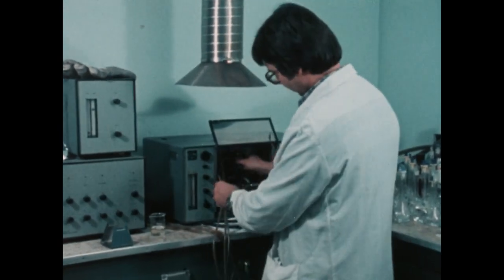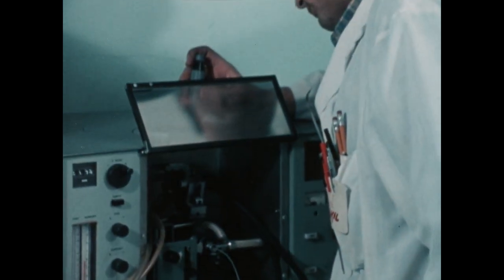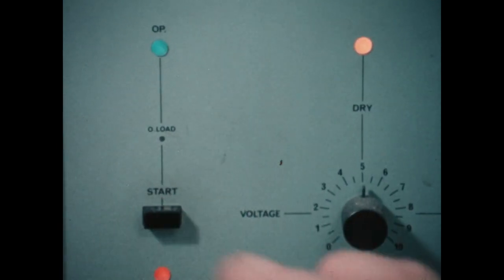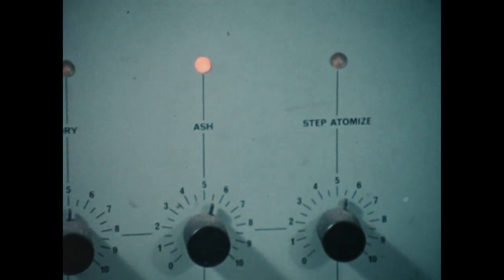When heated sufficiently, the atoms of an element give off light that can be spread by a prism into a spectrum of distinct colors. This is a section of the spectrum of gold, iron, sulfur. Spectra are as individual as fingerprints, so they can help us identify unknown atoms. We place a tiny sample of the substance in the spectrograph. We'll heat it far beyond the point at which it vaporizes, until its atoms emit light. Then we'll photograph the spectrum of that light from our unknown substance.